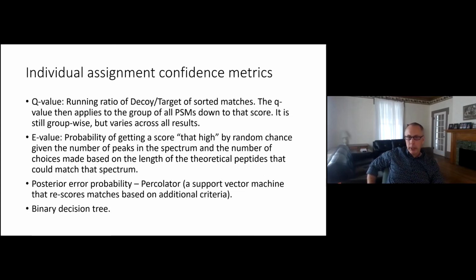All right, basically, if you find that the average random chance for this would be like 3 or 4, and you happen to get 9, then you call that match good. And if the match to your actual peptide is below that, then you call it bad. In practice, I find that this is not an effective strategy, but it does have its proponents.